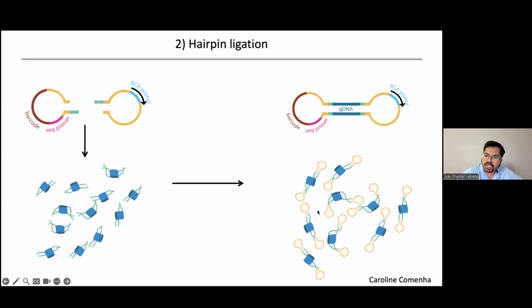But one thing that we did is that we wanted to further attach these DNA sequences to the gel, because the next step that we do is form a gel. But before we form the gel, we hybridize an anchor sequence. This is called the oligo hook. It goes through this one particular hairpin, and what it has on both sides is an acrydite moiety. You can get these acrydited oligos from IDT.